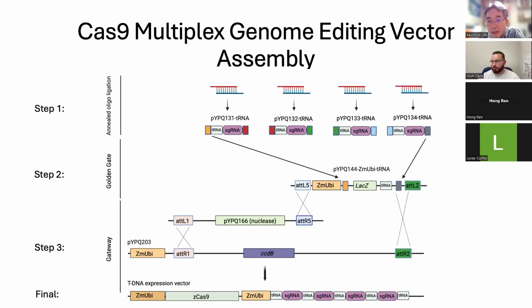Thank you. The next question from Joy Joey is, what is the criteria for selecting guides after analyzing secondary structures? Criteria for selecting guide RNAs. So this is sort of difficult because there's no perfect parameter. There is no such thing as a perfect guide RNA, right? I think a lot of it depends on the locus at which you're interested in performing genome editing.